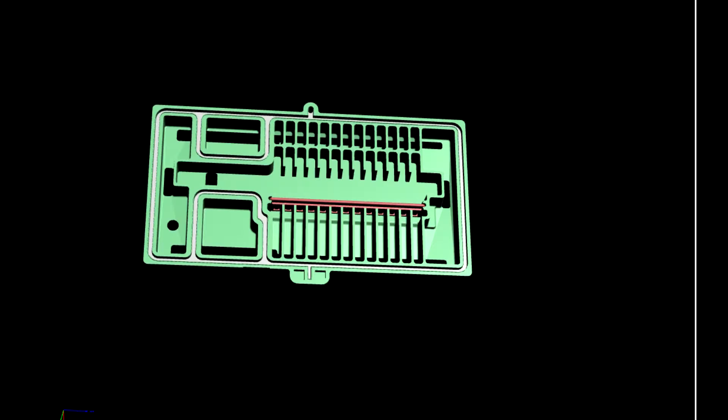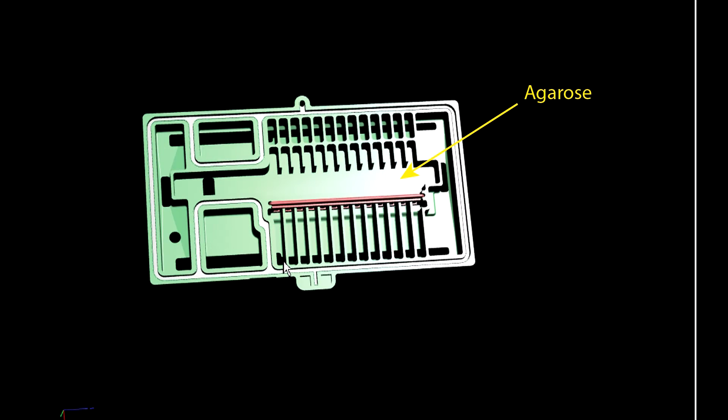During manufacture, the agarose gel is cast into the top cover in an inverted position.